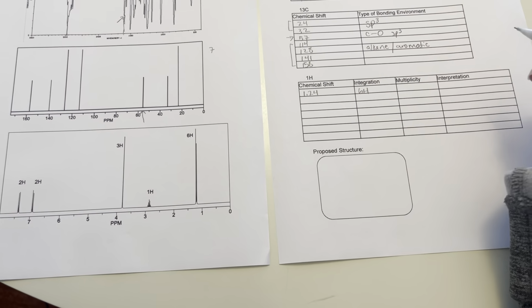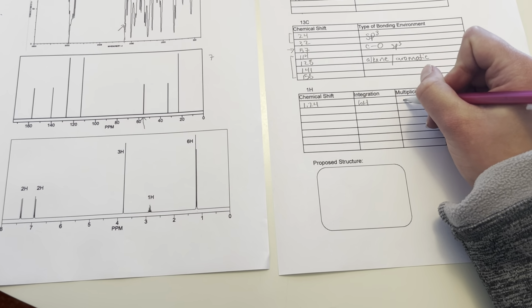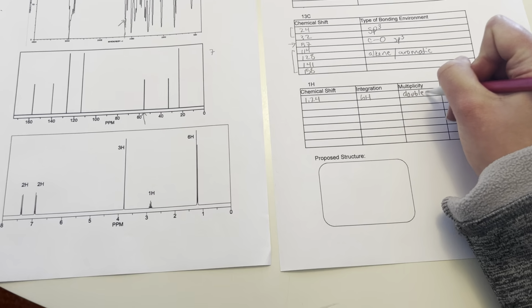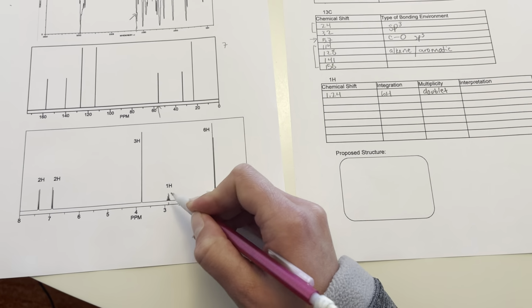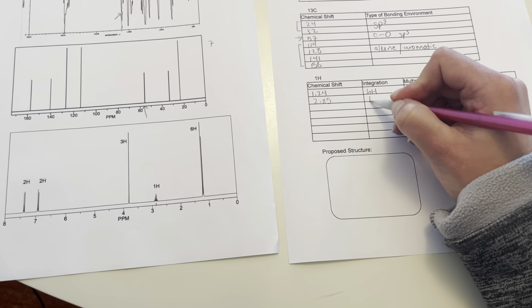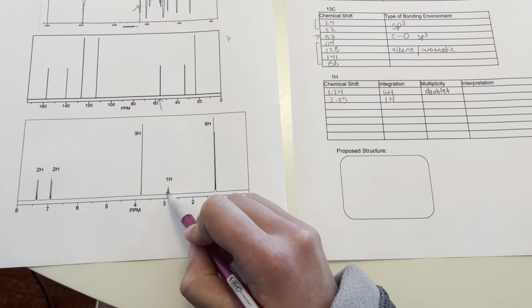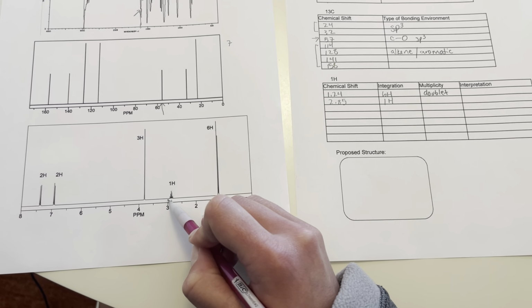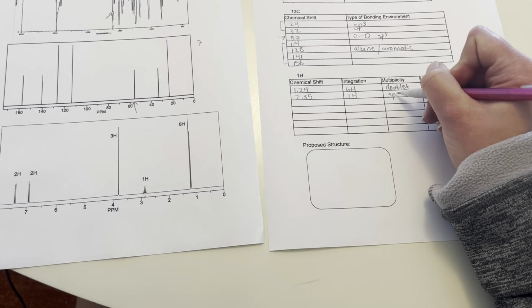It looks like there are only 2 peaks here, so that's going to be a doublet. The next one is about 2.85. It's 1H, and it looks like there are 7 peaks, so a septet.